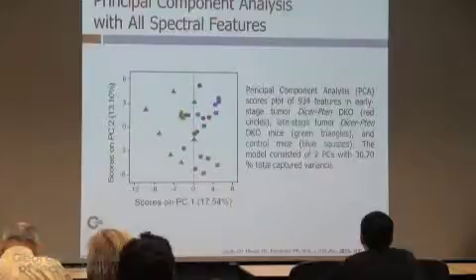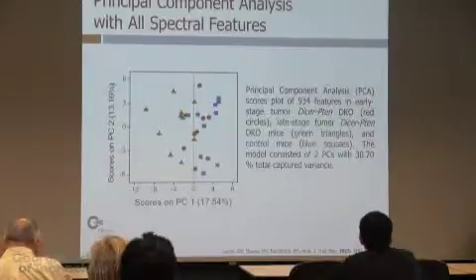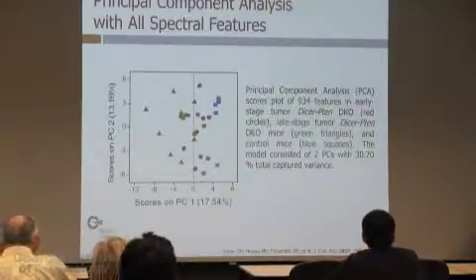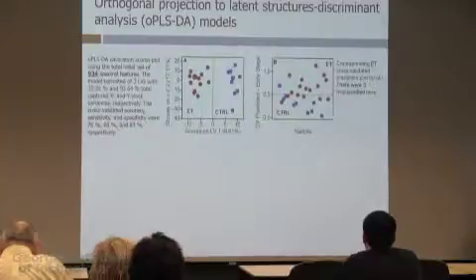And we used all the data for this. We are talking about a set of 934 features. Like I told you, there are more than 934 known metabolites. So by no means are we looking at the whole metabolome. It's a good fraction, maybe I'm going to say a tenth, depending on what you know. But this is all negative ion mode data, so we're specifically looking at molecules that can deprotonate. So let me show you what happens when you do this in a supervised fashion.